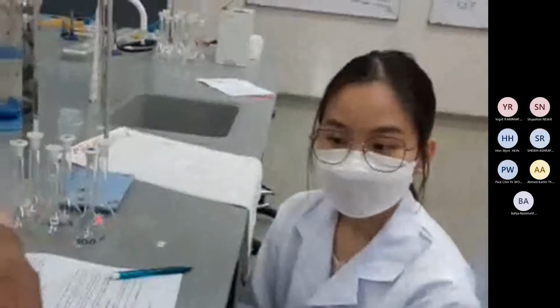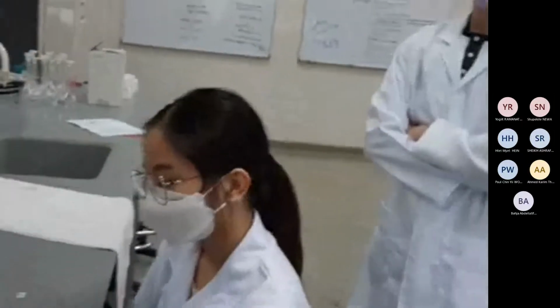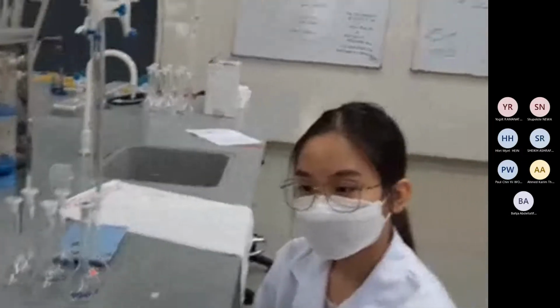Blank in this case is water. Sometimes we have another solution that we use for preparation, so we will use that one for the blank. Put it here, press 0. All right, that's it. It takes just 2 seconds.